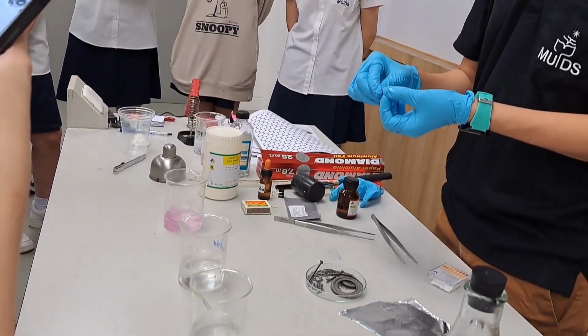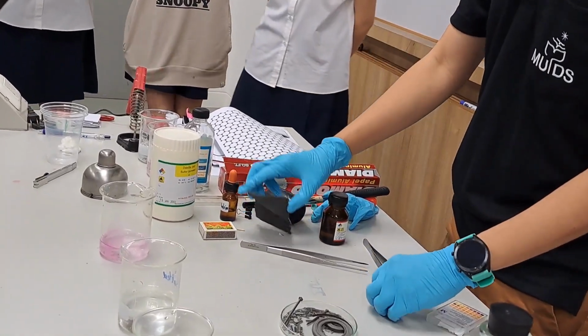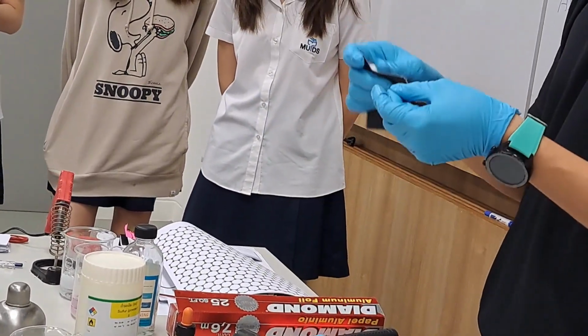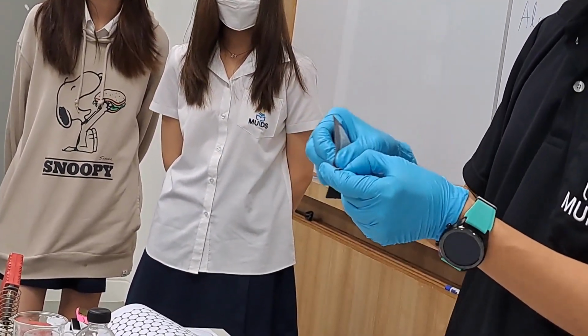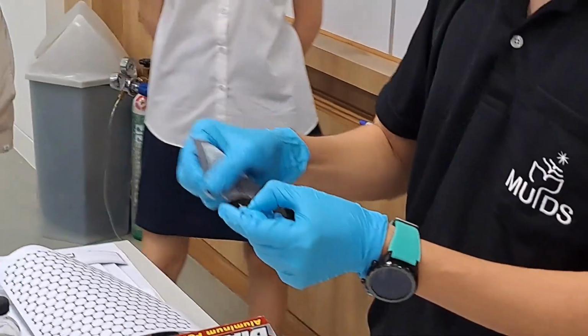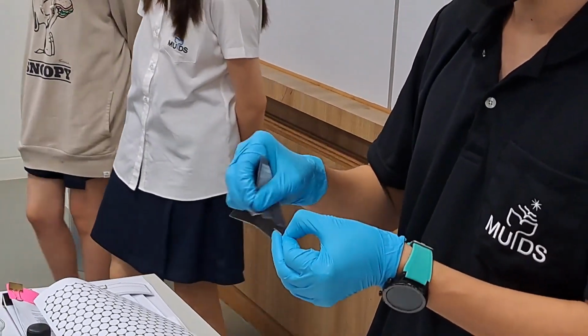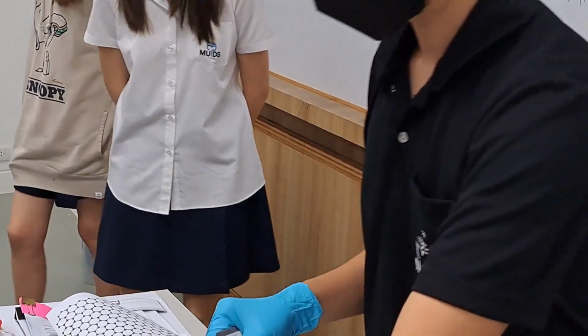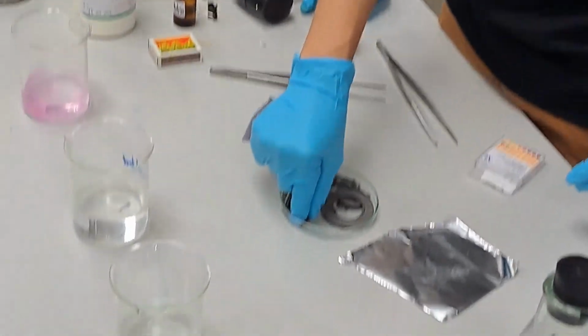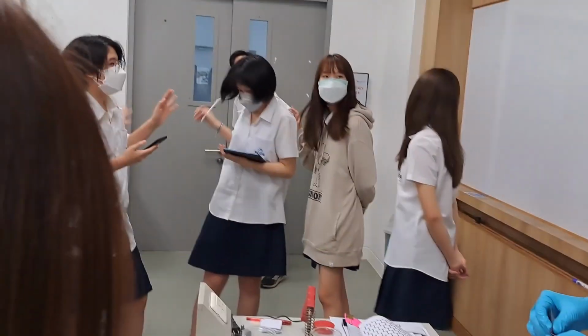And I will drop this piece of magnesium. So magnesium does have some coating on it. I will use sandpaper to remove some of the coating, to activate the surface. We will talk about this soon. Alright, let's activate this one. Drop it there.